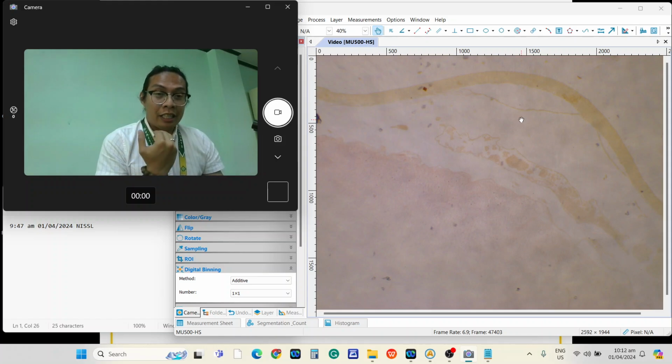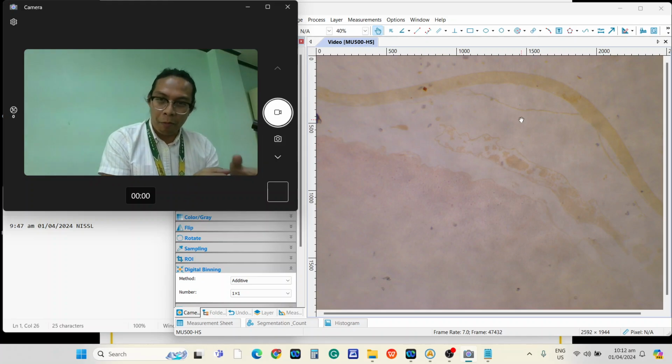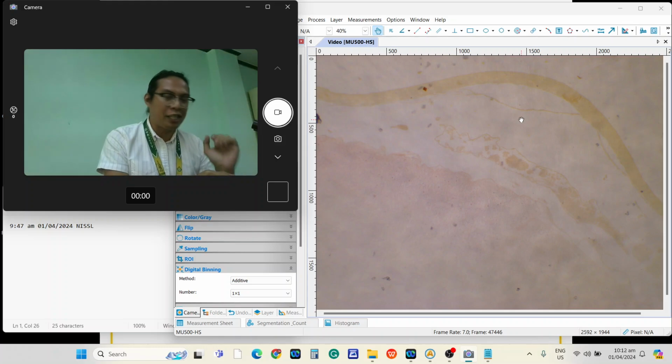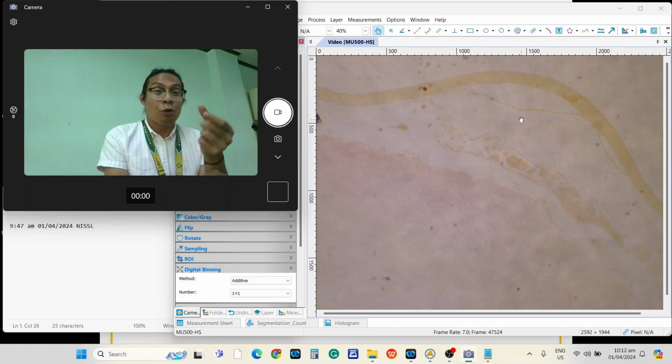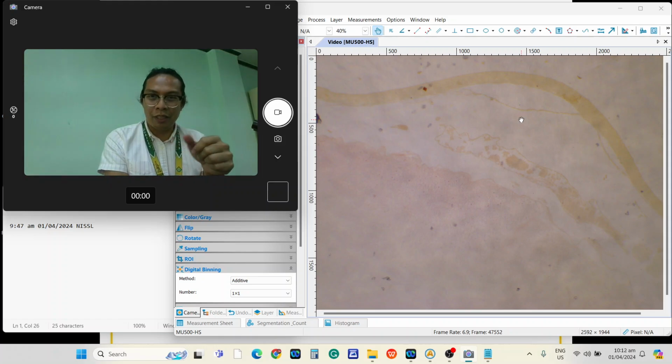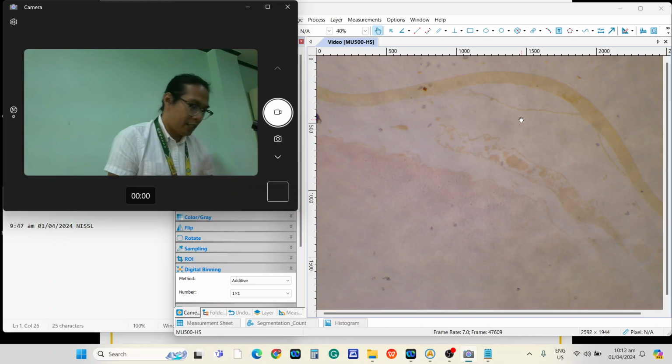Always start in the least magnification, scanner. Moving on to LPO, then HPO. Pag nasa HPO na kayo, huwag nyo nang gagalawin ang coarse adjustments. Kung motic ang gamit nyo, wala siyang fine. Konting-konting galaw lang ng adjustment knob. Kasi kapag napadiin kayo doon, mababasa. Okay. Hindi na ako sa sermon.